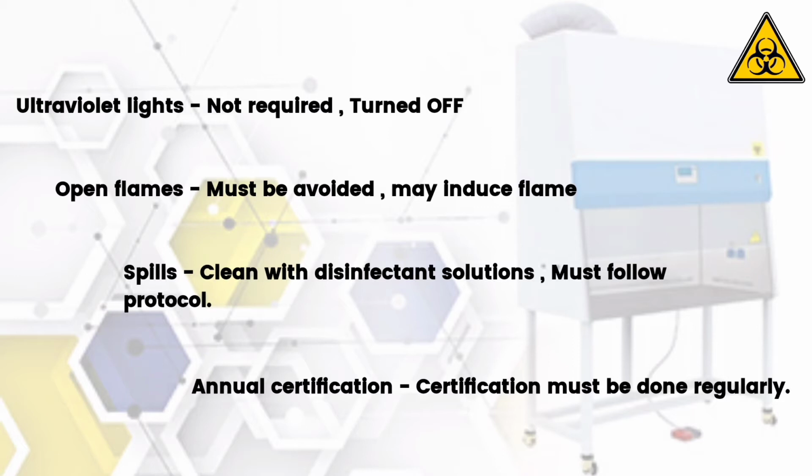Open flames. Inside the biosafety cabinet, it is a microbe-free environment. Therefore, open flames must be avoided. This may interrupt the airflow inside the cabinet or induce flame with any flame-causing substances.